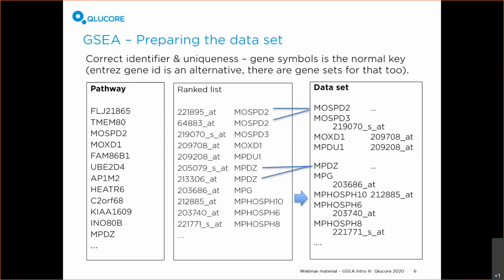Did you see this slide, or do you want me to continue? Okay, so let's have a look at this as well.